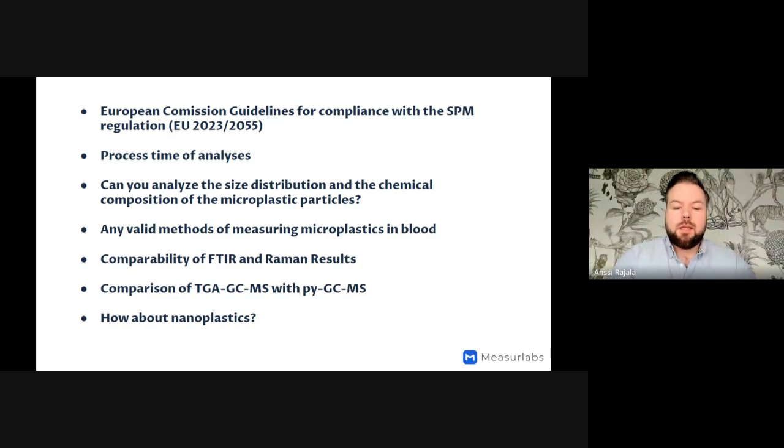Also TED GCMS might be good, but if sample preparation can be used and the matrix is very homogeneous, then pyrolysis GCMS is very well suited, and it has the lower detection limit, so that's why it's usually best.